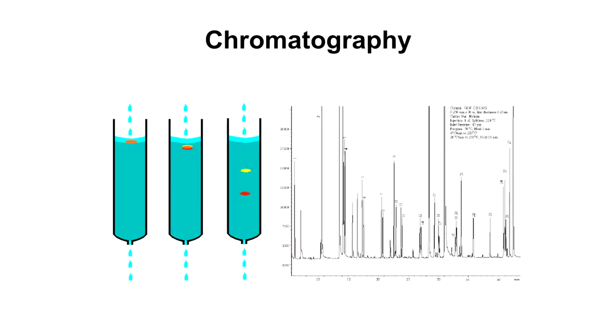I'm not going to talk a lot about NMR. That'll be the next lecture. But to dive in some of the other technologies for metabolomics, just so you have context and can kind of appreciate what's typically used in a full-bore metabolomic analysis. So the first one we'll talk about is chromatography, which in essence involves the separation of components and mixtures.